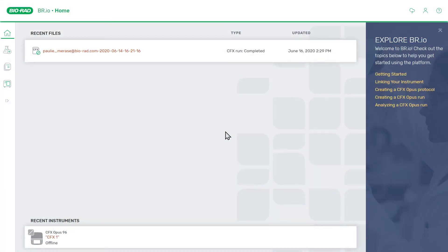Welcome back to this introductory video series on BioRad's br.io cloud platform for laboratory instruments. In this video, we will walk you through how to review and export run data from a CFX Opus real-time PCR system using the br.io cloud platform. This is a continuation of the last video where we learned how to set up and perform a run on the CFX Opus system.